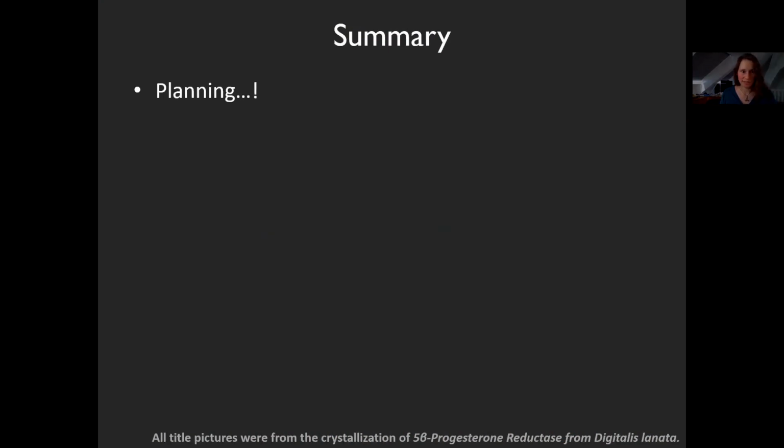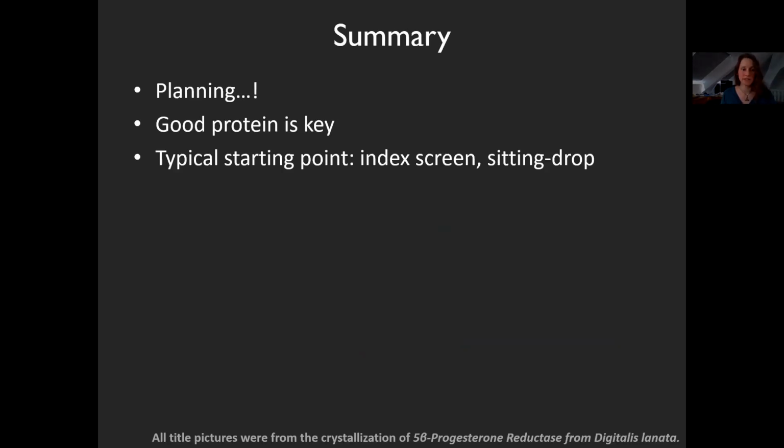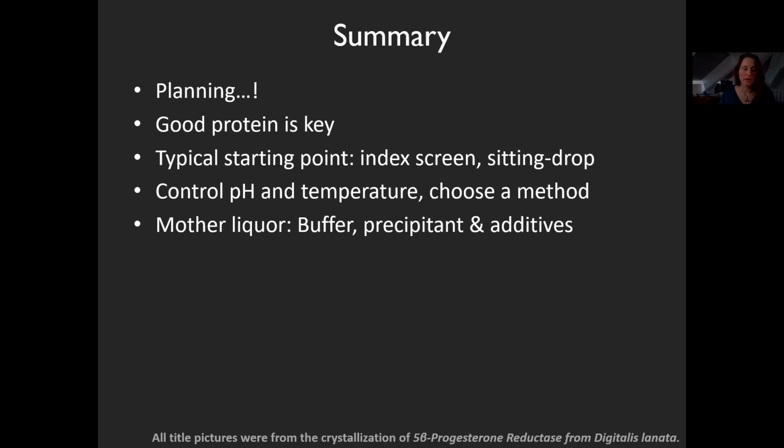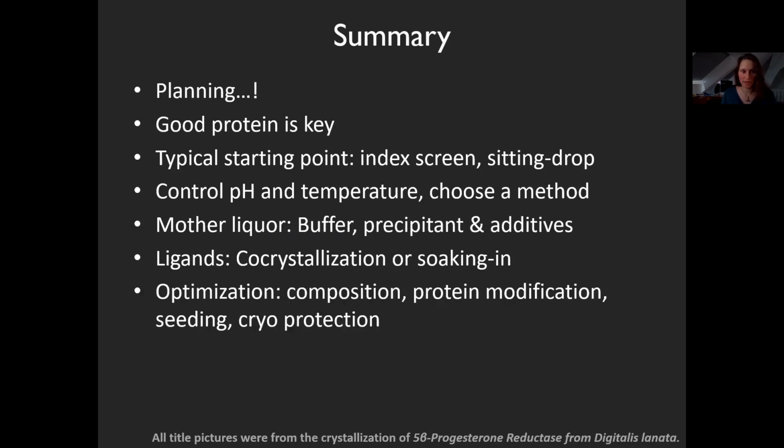In summary, plan your experiments, also your crystallization experiment. Good protein sample, pure, stable, good buffer is key. Typical starting points are index screens and sitting drop plates, typically pipetted by a robot in large labs and hand pipetted hanging drop plates in smaller labs. Control pH and temperature, choose a method. Your mother liquor is a buffer, precipitant, and additives as outlined. Your ligands, you can co-crystallize or soak in.